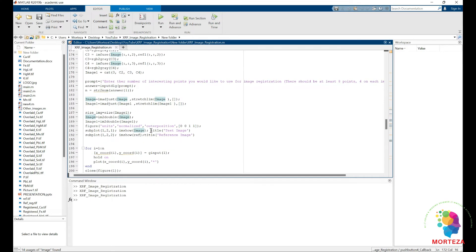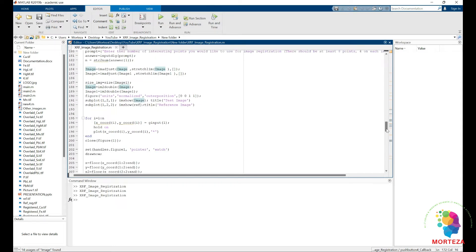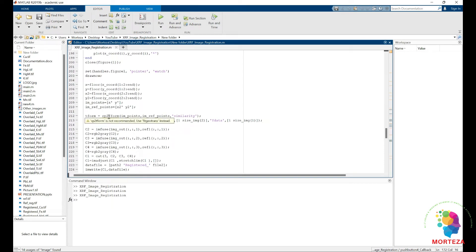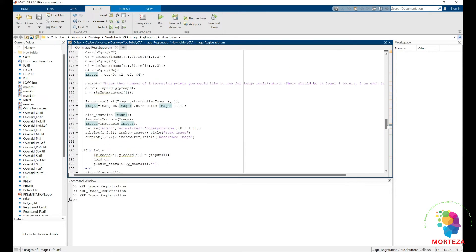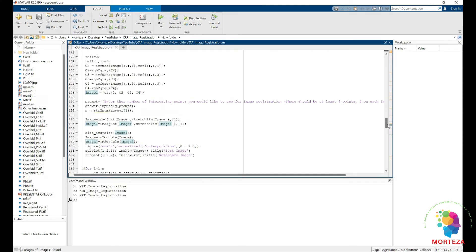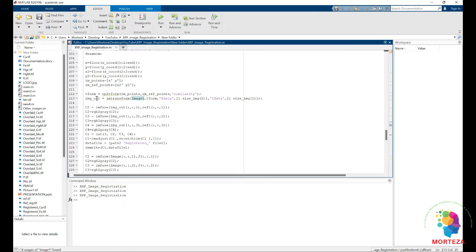Here is where the interesting common points are selected between the XRF image and the RGB image, and they are used to transform the image. This is the cp2tform function. The transformation matrix T-form is computed from the selected corresponding points between the reference and the XRF image. The matrix is then used to transform the enlarged XRF image, moving it to be at the same position as the reference image.